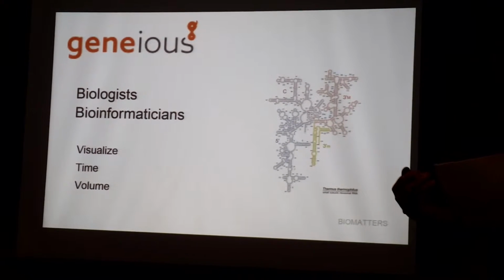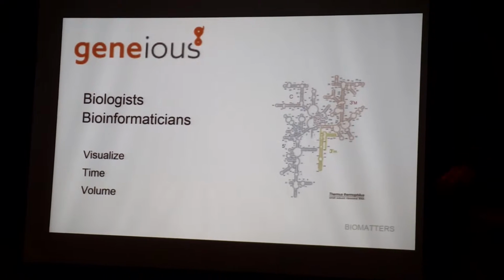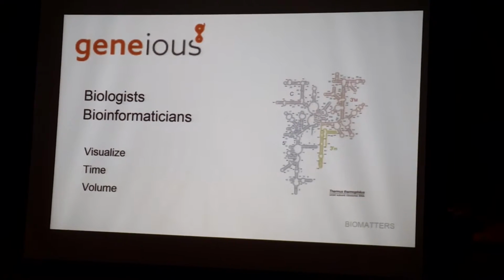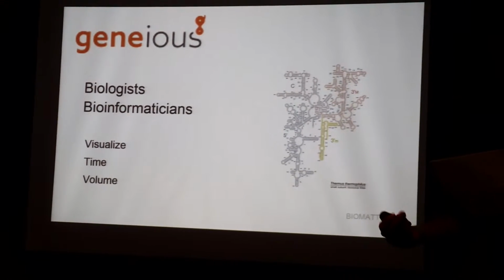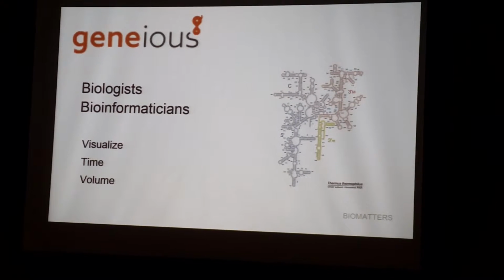And of course, because of the overload of data that the bioinformaticians have to deal with, the time that it takes to get your results back is often long, and again, this speaks to the biologists being able to do it themselves, because then they don't have to wait, they can just do it themselves. And thirdly is the issue of visualization.